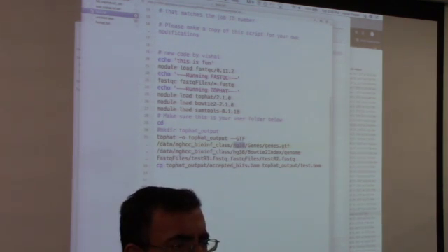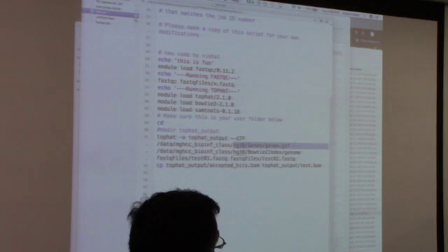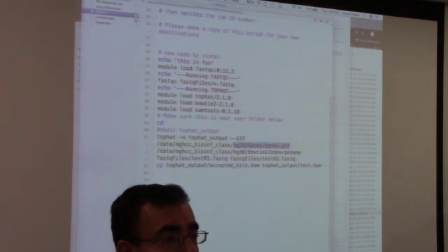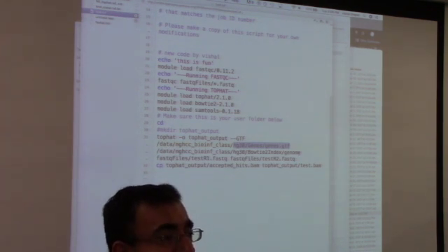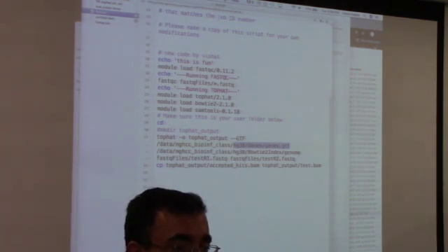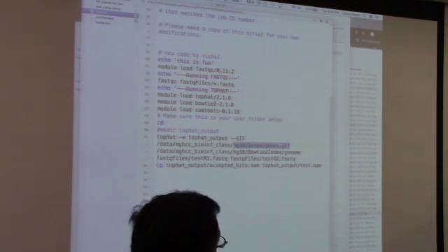Do you understand what we're going to do though? No? Okay. Let me explain. You need this HG38 directory which contains the genes.gtf and the bowtie index. Do you understand why you need this? That was the lecture I gave half an hour ago, which was to tell you that these files are required: the index file, the genome file, and the GTF file. These files are present in this directory right now, here.